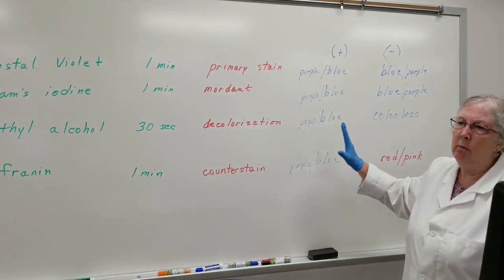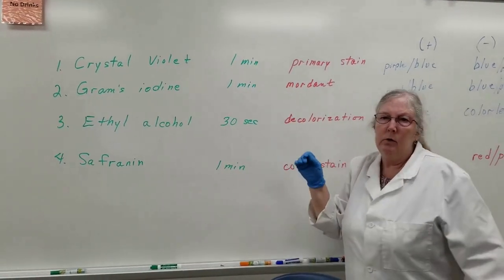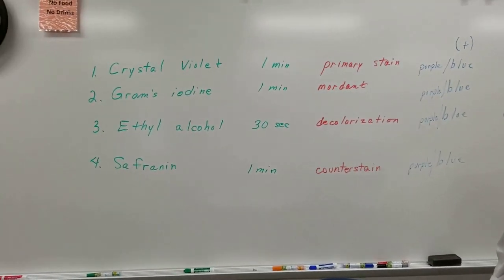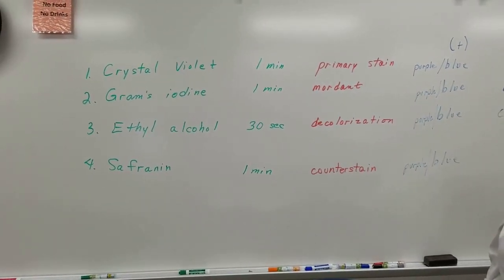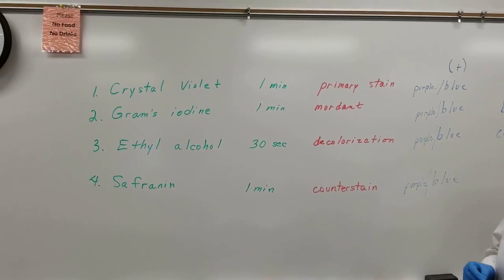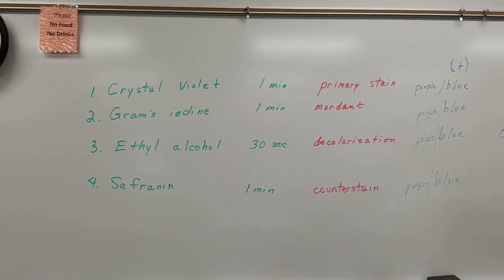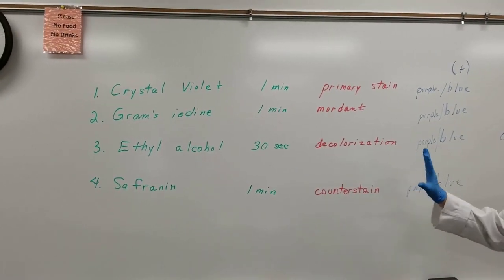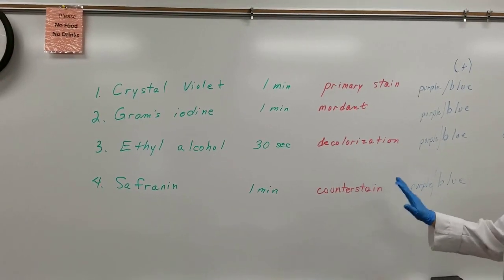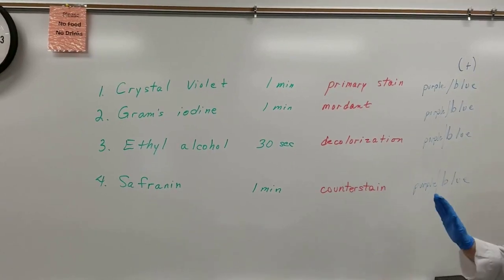And please remember, before you even start this first step here, you had to do the smear on the slide and you had to heat fix it. If you did not heat fix your sample, A, you would not have killed the cells. B, you would not have had them adhere to the slide. So you may not see anything at all because you probably washed them off. This is the Gram stain. You need to know how to do this. This is so basic and fundamental to the field of microbiology.